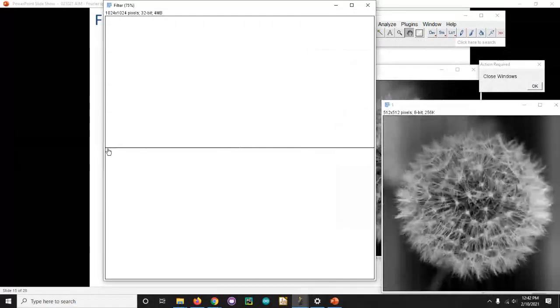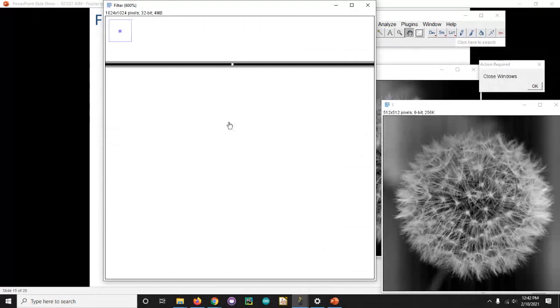So this is the filter, so this makes sense, right? The filter removed all the spatial frequencies in the horizontal axis, which is removing only edges that are perfectly vertical. And you can also see the one thing it did for us is right in the middle, it kept that DC term, right? So that means it preserved the mean intensity of our image as well. Now it's not perfect, right? Because the image also had information coded on this. So we do get these sort of streaking artifacts, but the streaking artifacts are far less than the original lines we had.